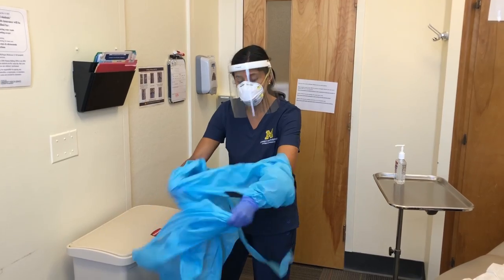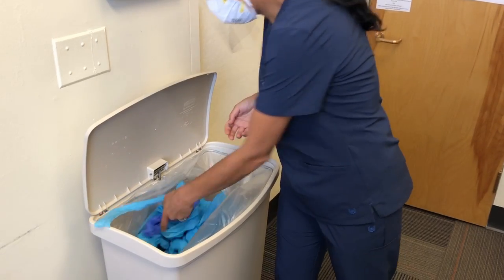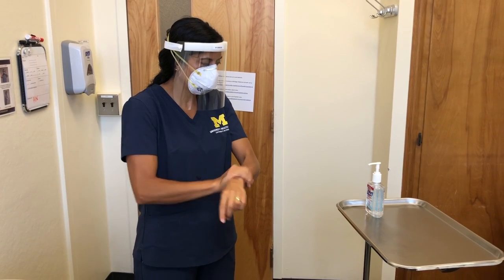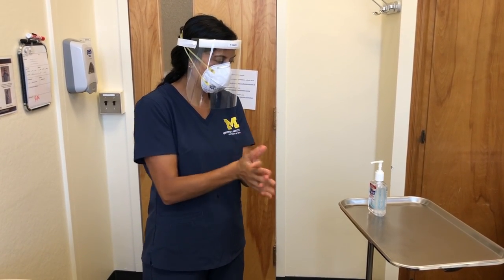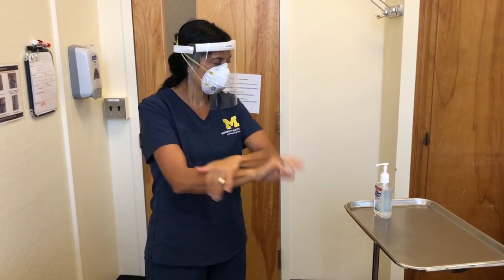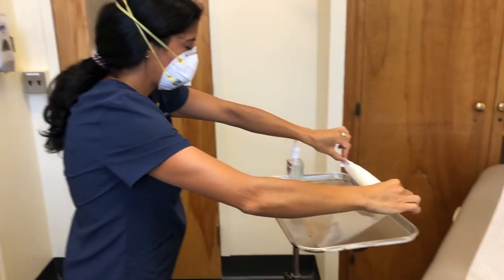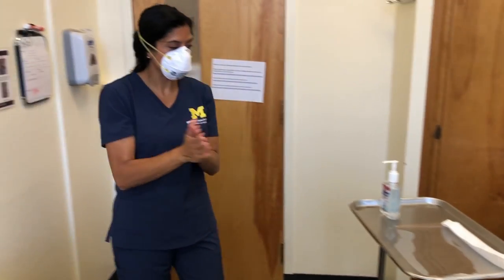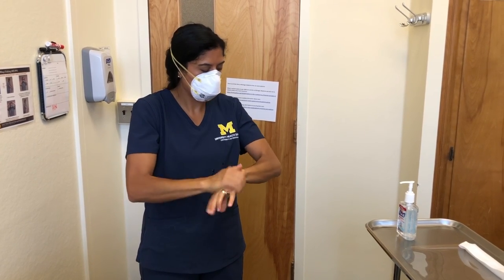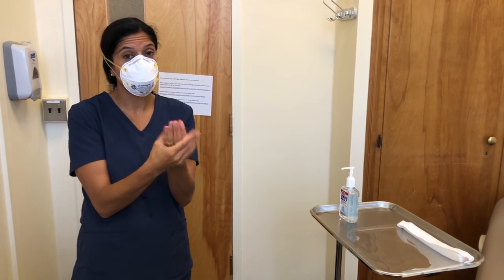So first I'm going to take off my gown and my gloves at the same time. Sanitize my hands. 30 seconds have gone by. Next, I'm going to take off my face shield. Again, hand sanitize. And last, I'm going to take off my mask.